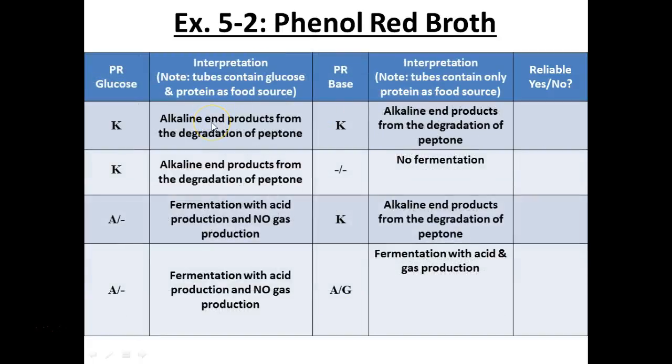Given the choice, right? So this would be Annie and Tamara's, right? Given the choice between protein and sugar, hers chose protein. Turned pink. So of course it makes sense when we gave it just protein. He's like, okay, I'll eat it again. Right? No problem. Yum. Would you trust this if it would choose protein over sugar here? And then when given protein only, he didn't do anything? Right? So this is one of those ones where, did it even grow? Did you just inoculate it with dead bacteria and that's why nothing happened? Could be, right? You wouldn't trust this though, right? You'd repeat.